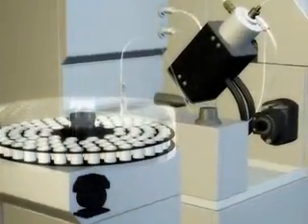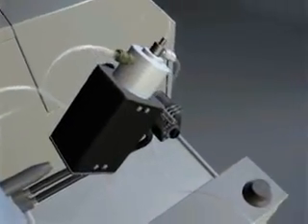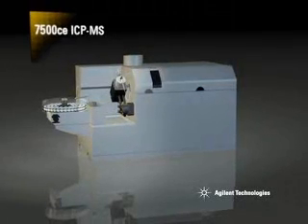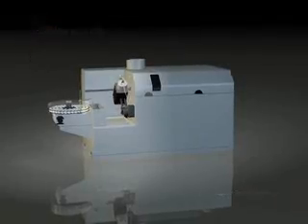The Agilent 7500 CE benchtop ICPMS with octopole reaction system technology is revolutionizing ICPMS. Its unique octopole reaction system removes spectral interferences, allowing ultra-trace measurement over the widest elemental range, even in the most complex and challenging sample types. Let's take a look at the key components of the 7500 CE.